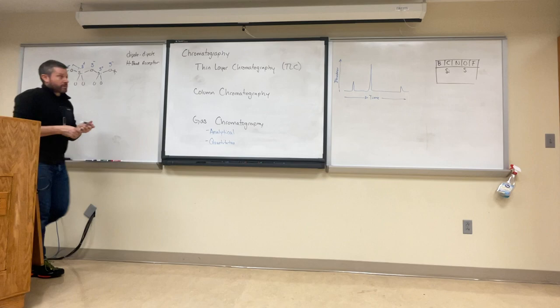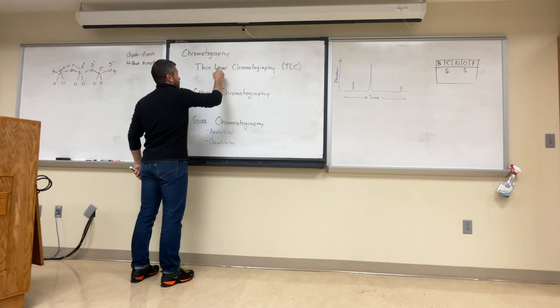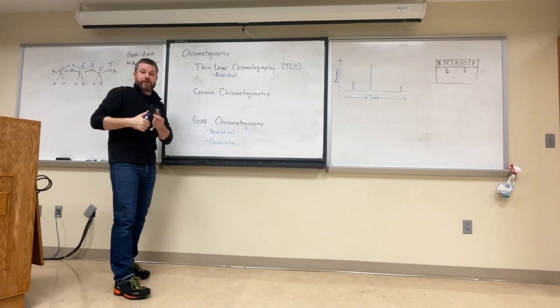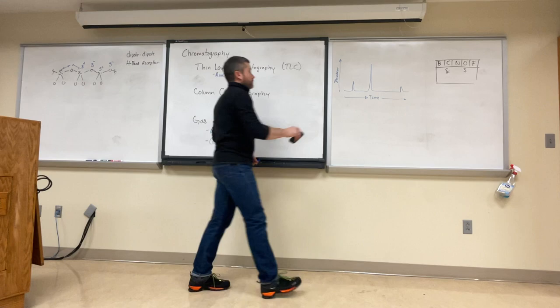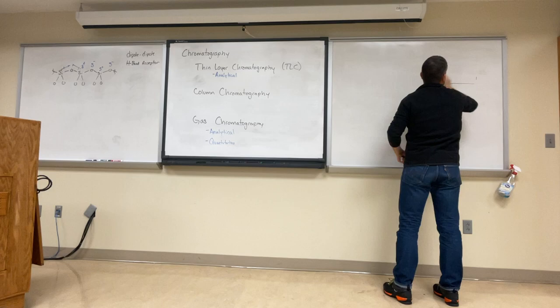All right, so thin layer chromatography, just like gas chromatography, is also analytical. If we run TLC, we can figure out roughly how many things are in a mixture of organic molecules. So I want to explain how TLC works functionally, what we're doing.